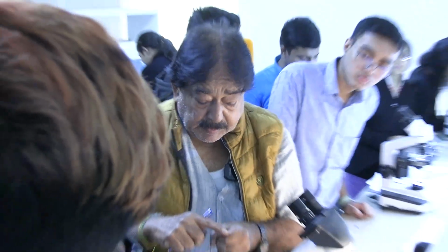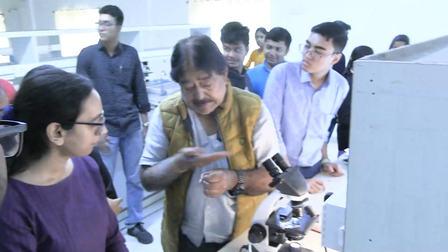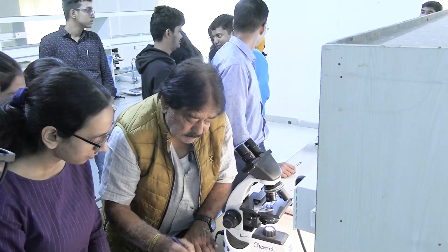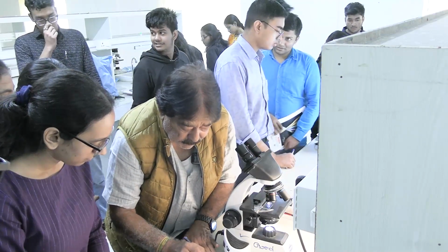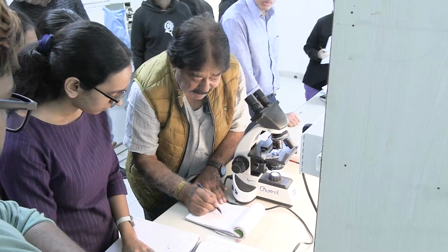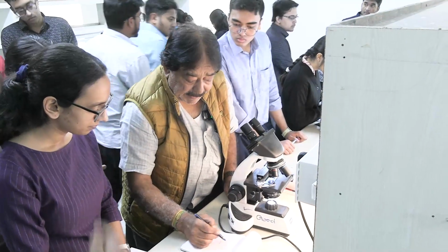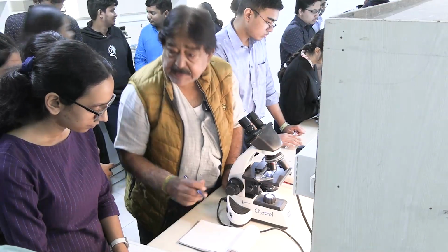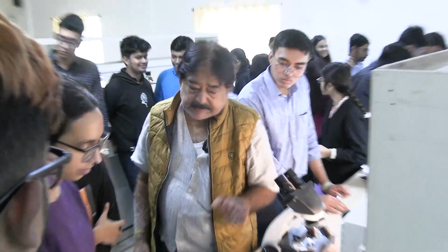A knife is going, and only a portion might come. ধরো এটা এই লেভেলে কেটেছে, এরকম যদি এই লেভেলে থাকলো, দেখা গেল একটা দুটো নিউক্লিয়াসগুলো দেখবে। এখানে একটা দুটো দেখতে পাচ্ছ, এখানে দেখো তিনটে ক্লাস্টার আছে। Esophageal, you see it.